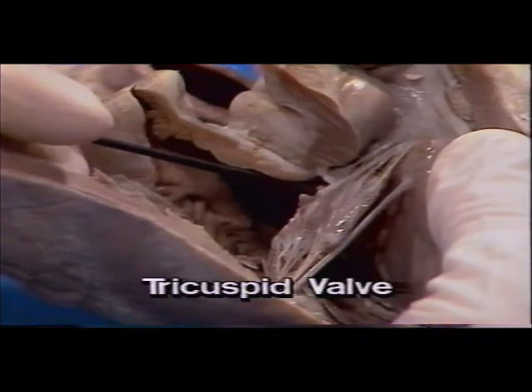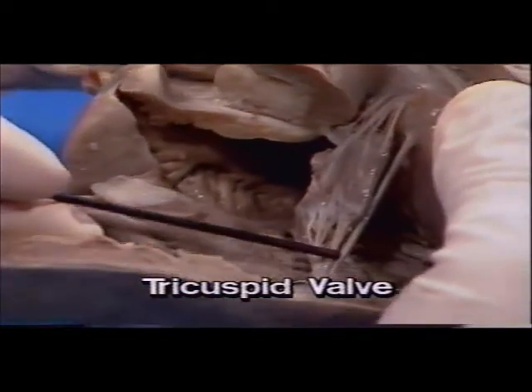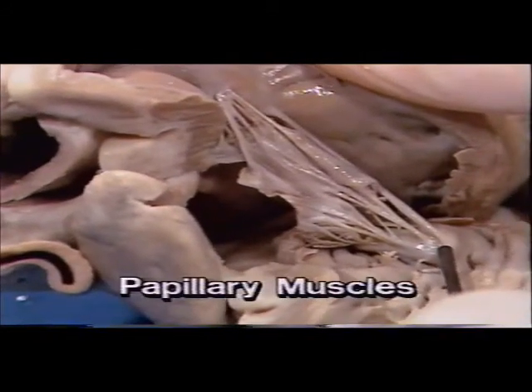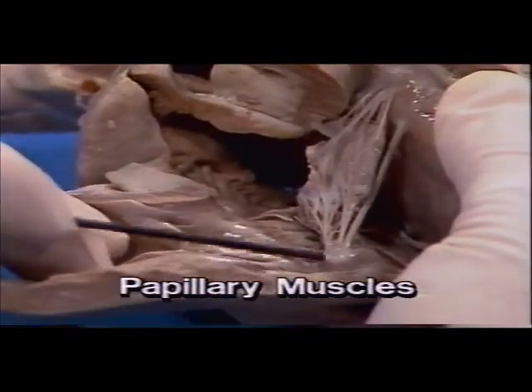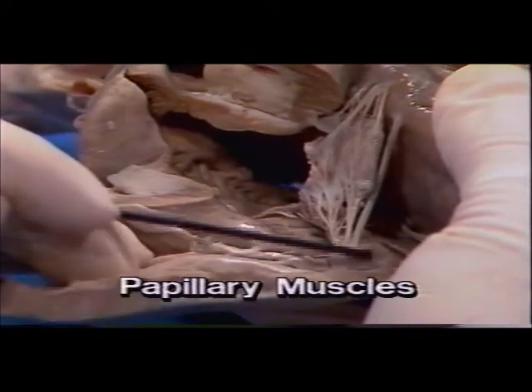Once more, observe that the valves are anchored to the chordae tendineae and that these, in turn, are attached to small papillary muscles extending from the myocardium of the heart wall.